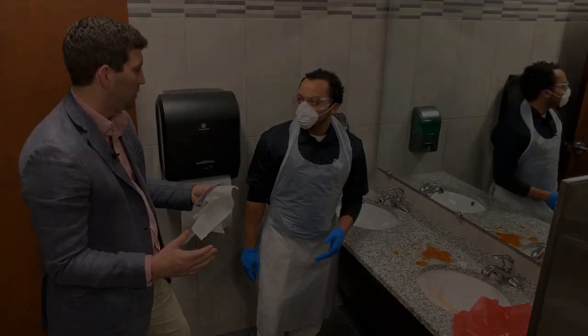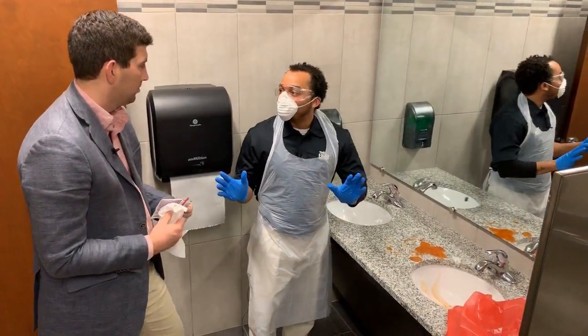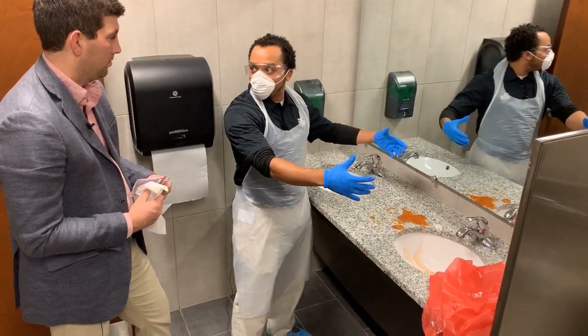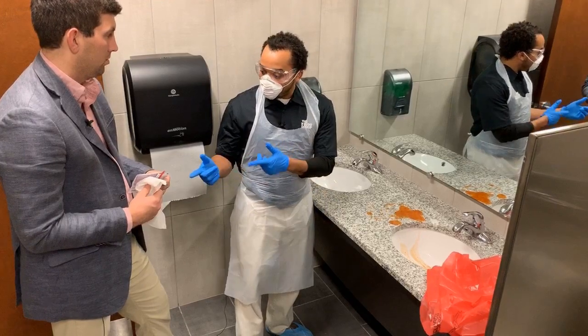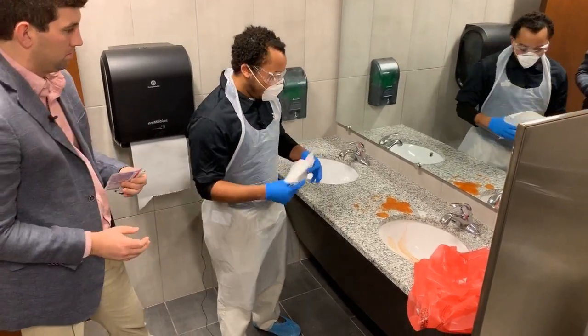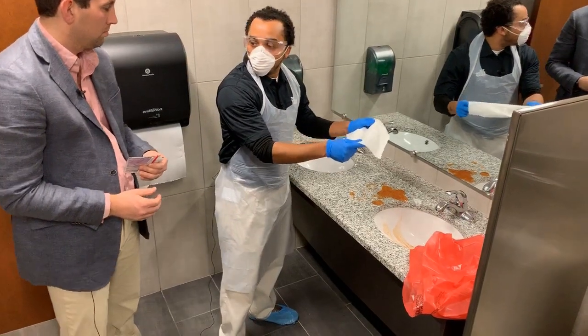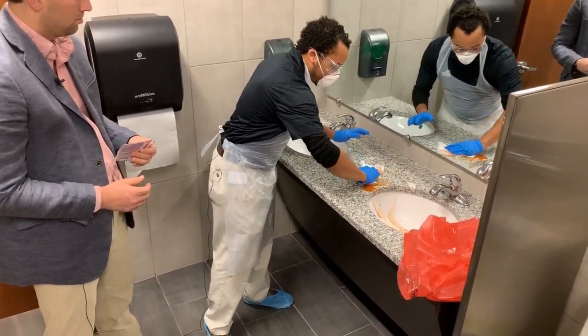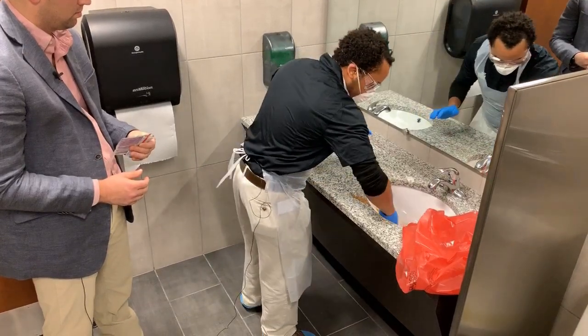All right, you're all suited up. So what's next? All right, first thing I want to do is examine the area, make sure I got everything within the contents of what I'm going to clean. And the first thing you're going to do is give me that absorbent paper towel, okay? Then we're going to take the absorbent paper towel and wipe all this loose liquid up, which is the bodily fluids and blood.